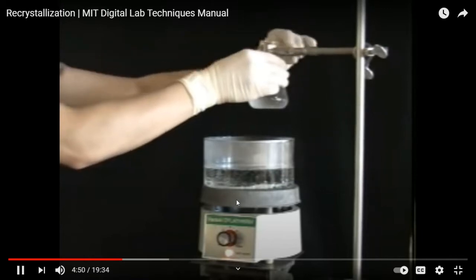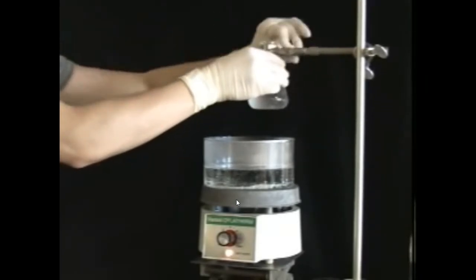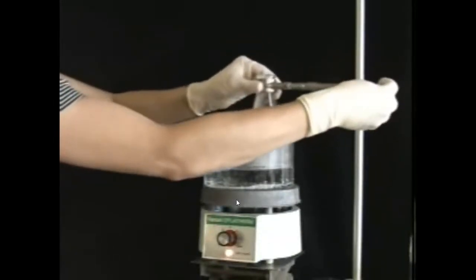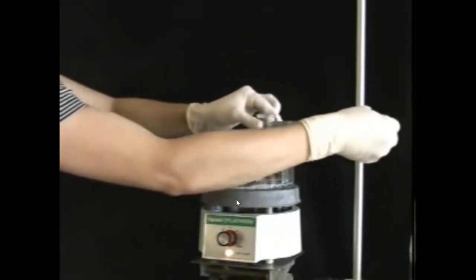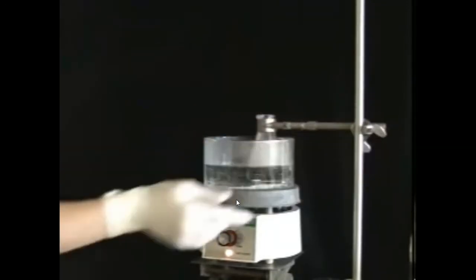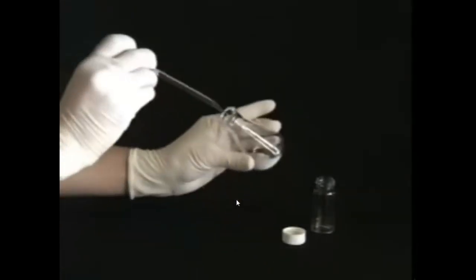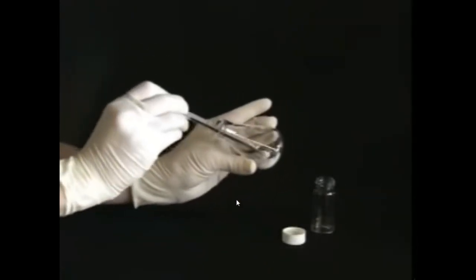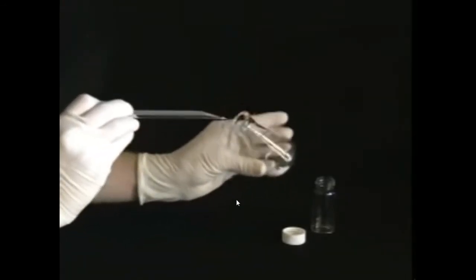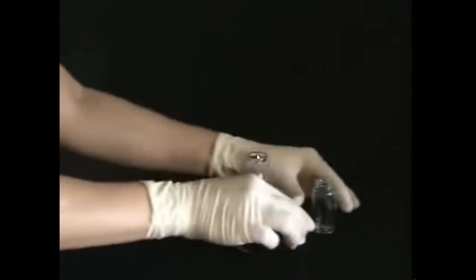Water bath. Remember to add some boiling stones and clamp the flask securely so that it doesn't tip over. Place the sample in an Erlenmeyer flask, but before adding solvent, it is a good idea to set aside a small crystal. It may come in handy later if you have trouble getting crystals to form.